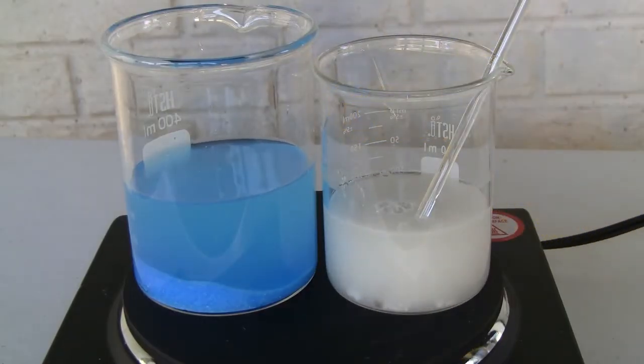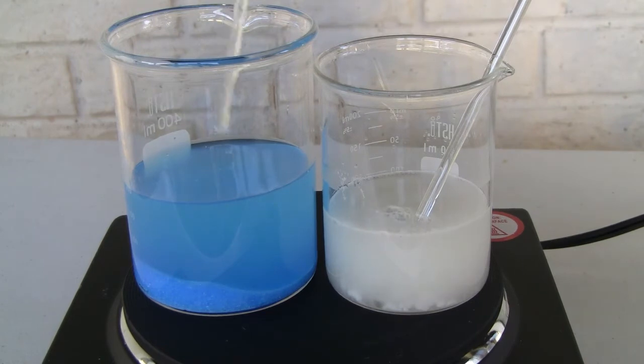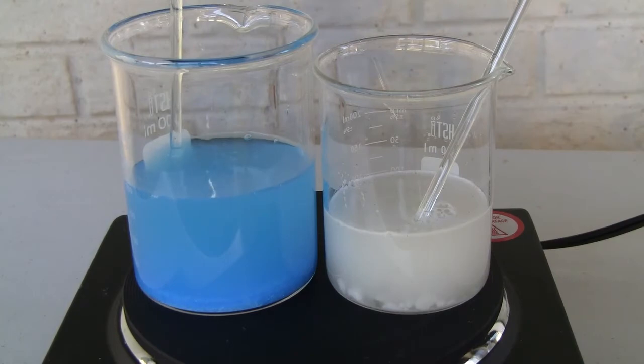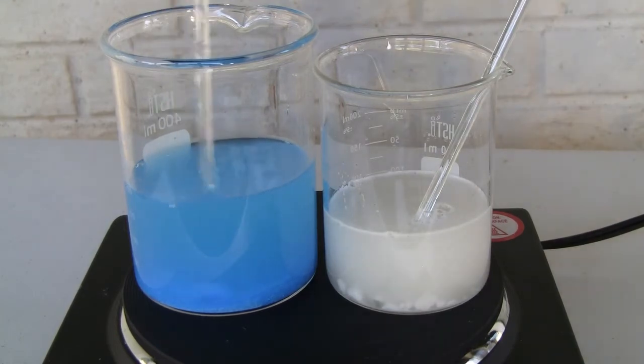To start, I dissolved the copper sulfate pentahydrate in about 175 milliliters of distilled water and the sodium carbonate in about 100 milliliters of water. The solution is then heated to make sure all solids are dissolved.